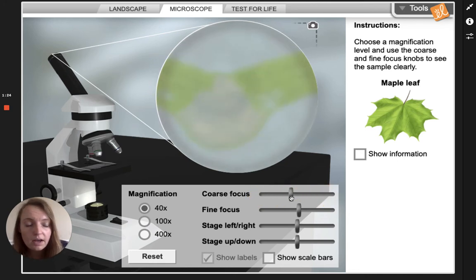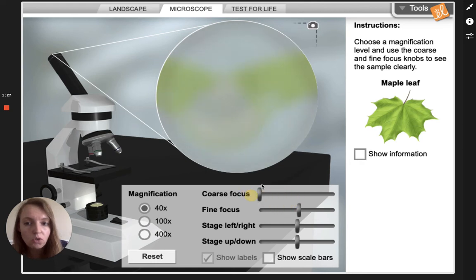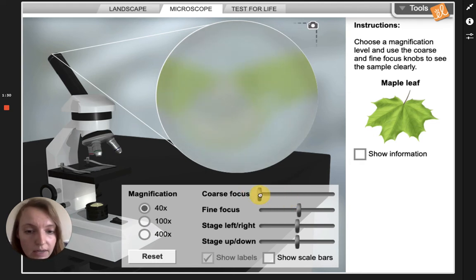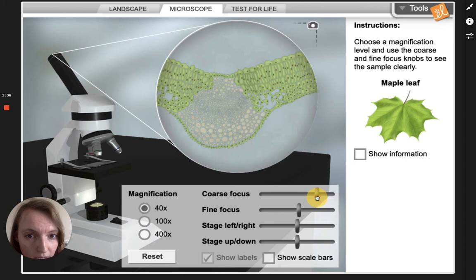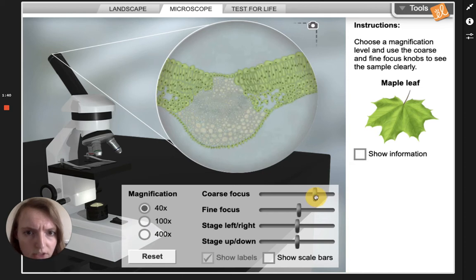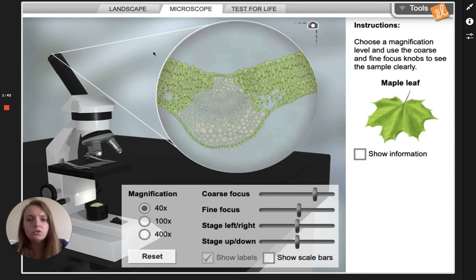In real life too, I would lower the stage all the way down and then slowly bring it up, trying to get it into focus. Here you can see I'm moving it and that looks pretty good. Alright, I've gotten it in focus at 40x.